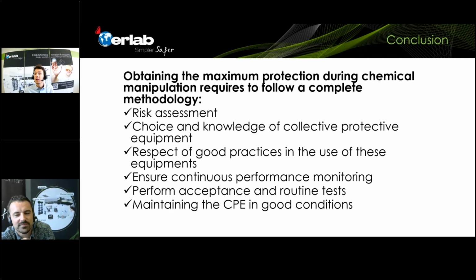Our laboratory will also look into the list of chemicals that you use to find the one chemical that is going to saturate the filter in the first place. That chemical will then be detected by the sensor. And so if the sensor detects any chemicals, it will give you an alarm.